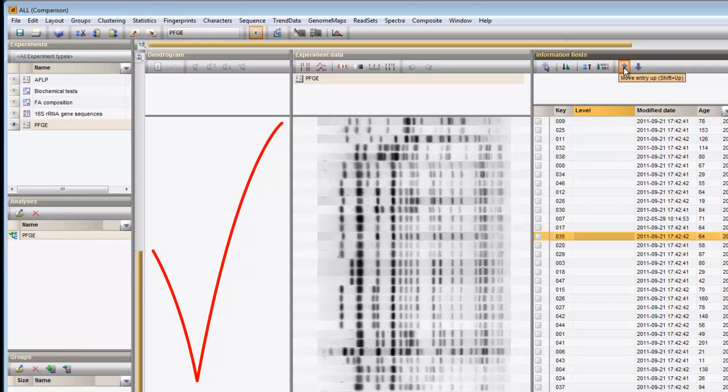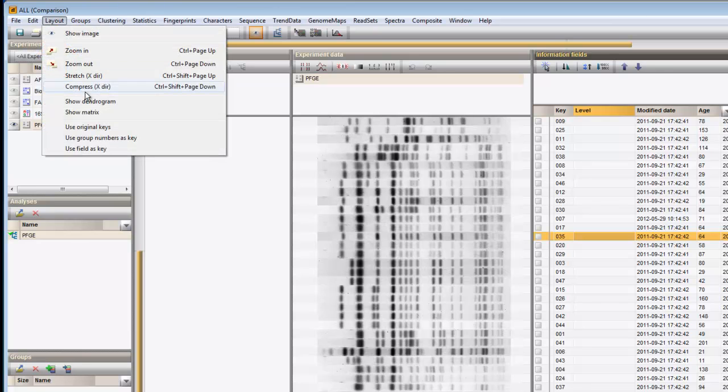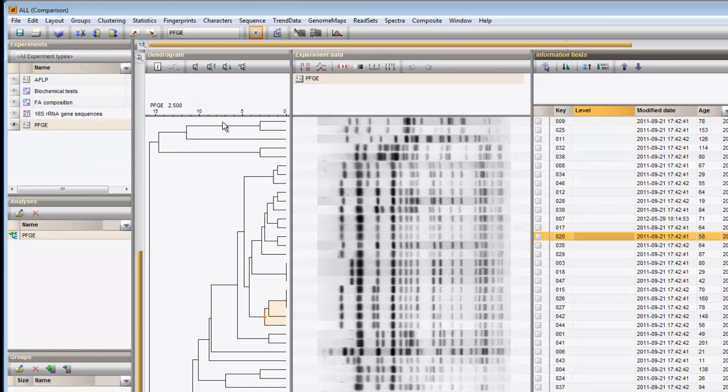I can restore a calculated tree at any time by choosing Layout, Show Dendrogram. For known clusters or to simplify the topology of a tree, I can collapse a branch using the Collapse Expand button.